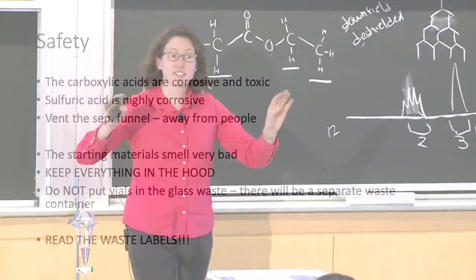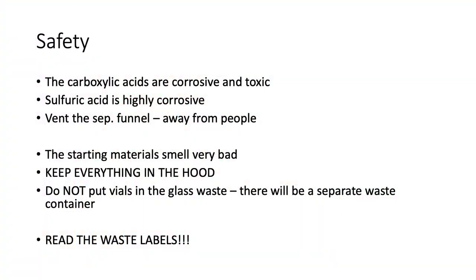Last but not least, safety for this lab is very important. The carboxylic acids are corrosive and toxic. They smell terrible. You can ask Tristan. He was the one who made all of the unknowns. And Brighton did the alcohols, so he got it slightly better, but Tristan will tell you that the carboxylic acids are very nasty to work with. Sulfuric acid is also highly corrosive, so you don't want to get that on your hands.